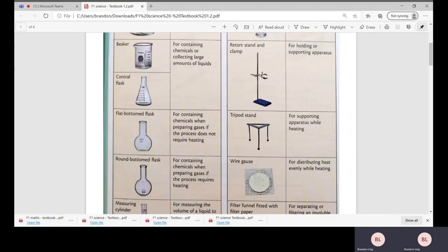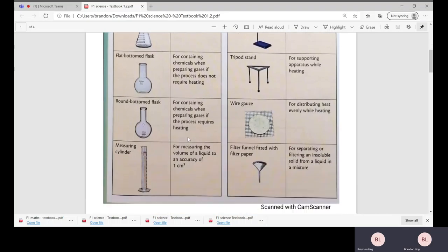Next we have the flat bottom flask and round bottom flask. The difference is the shape of the bottom part of the flask. For flat bottom flask, you are able to stand it on the table itself, whereas for round bottom flask you have to hold it while boiling.